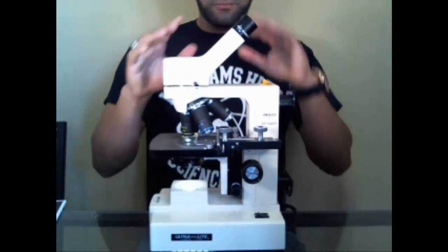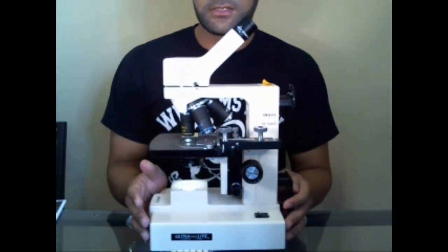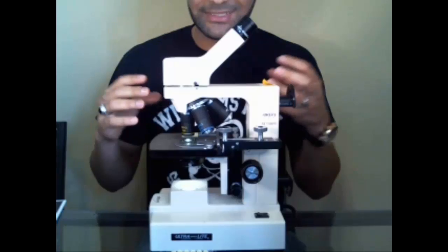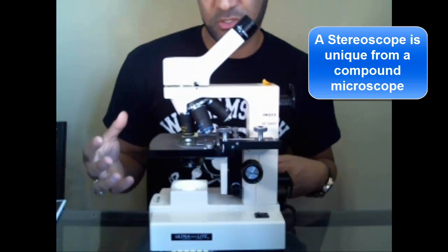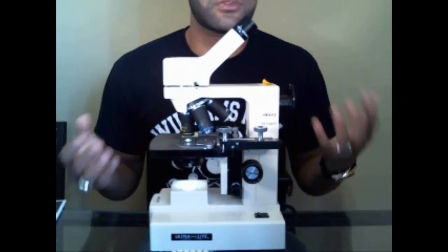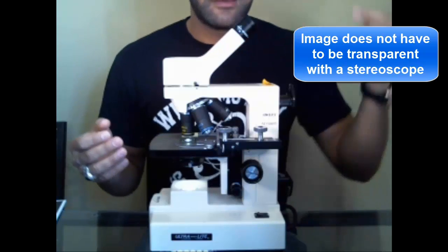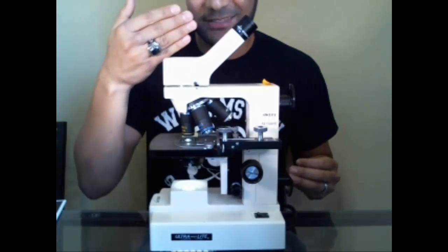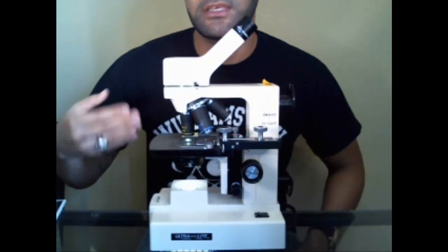A comparison: you may also use something called a stereoscope, which doesn't require light to pass through an image. It's basically a strong magnifying lens with a big stage at the bottom — you're just looking at whatever is on top from above, using room light. So you can look at something that doesn't need to be cut thin, unlike the compound microscope where light goes through the image directly into your eyepiece, requiring the specimen to be at least a little transparent.